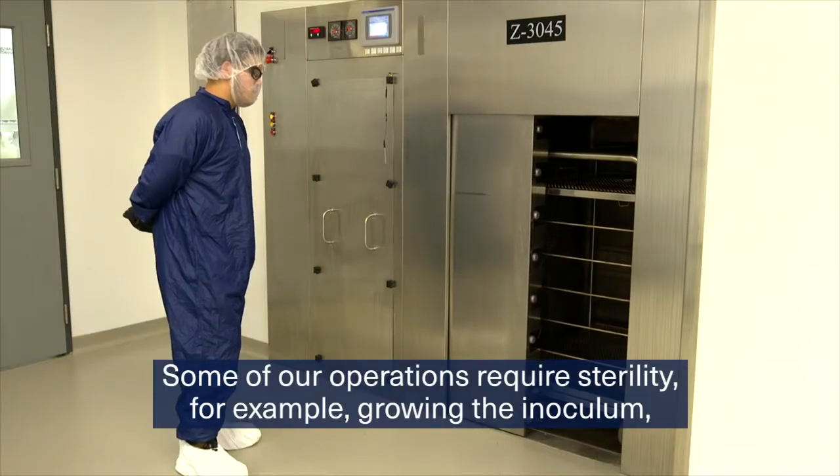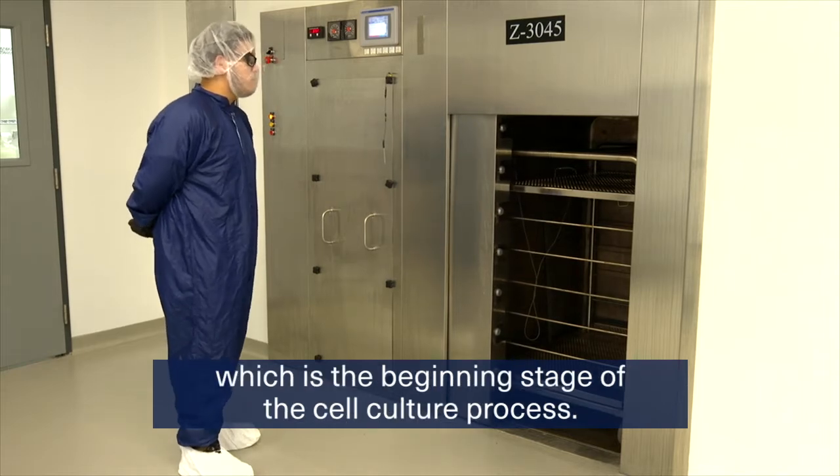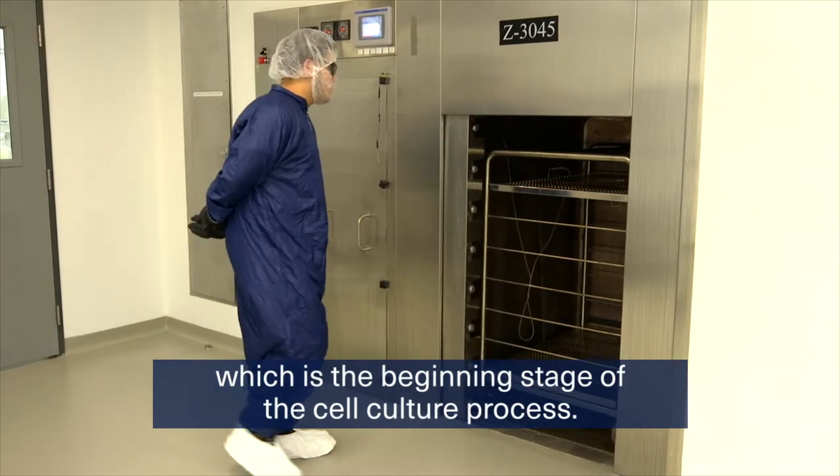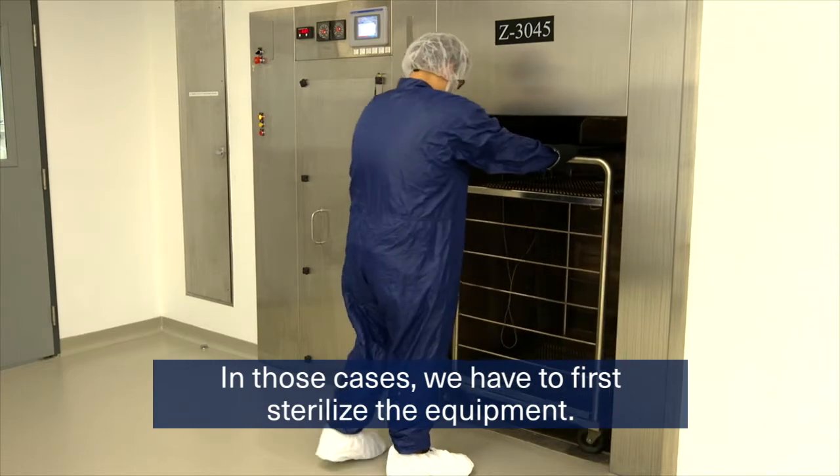Some of our operations require sterility, for example, growing the inoculum, which is the beginning stage of the cell culture process. In those cases, we have to first sterilize the equipment.